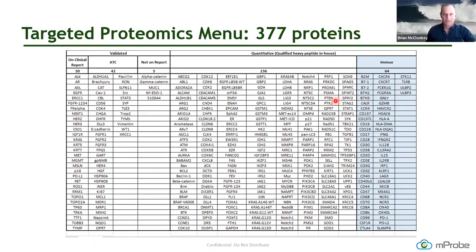So your menu is 377, but you offer 72 of the 377? Sorry, that's a basic question. That's right, that's the menu. 72 is what we offer, but we have a menu of 377. This is designed for R&D, designed for pharma. Sometimes they'll say, we would like to pick and choose, and let's see what we can do. But this is mostly for R&D folks or pharma. In some instances, oncology patients will say, I want to see whether I express Claudin 18.2, and some of that is in here.